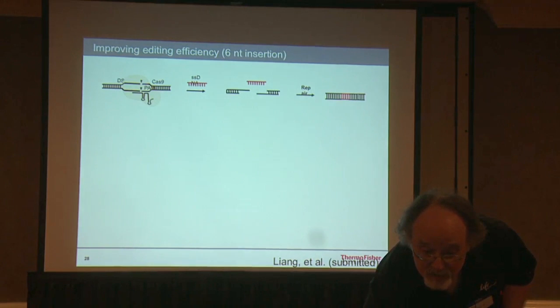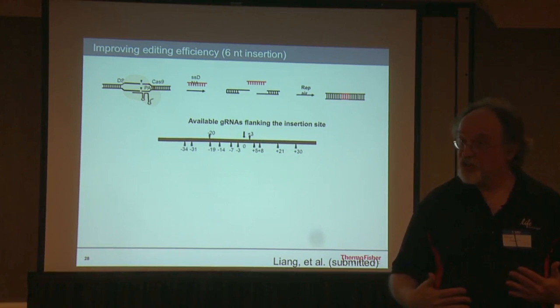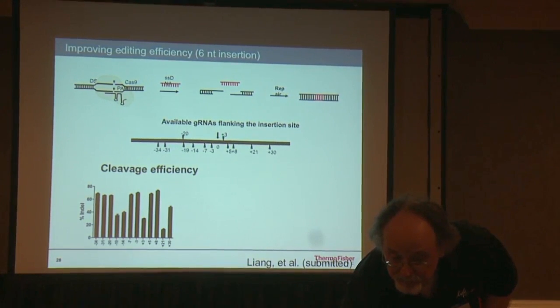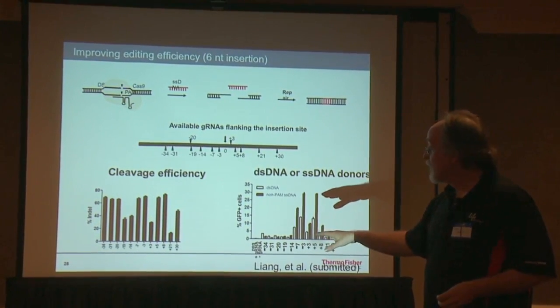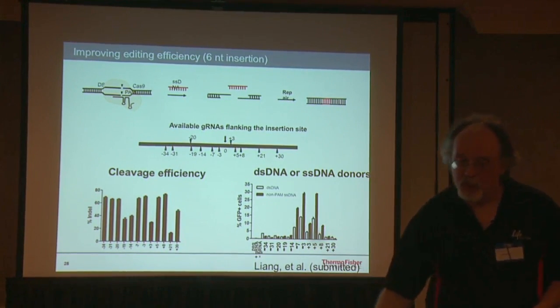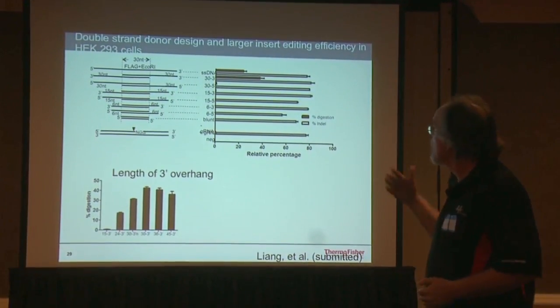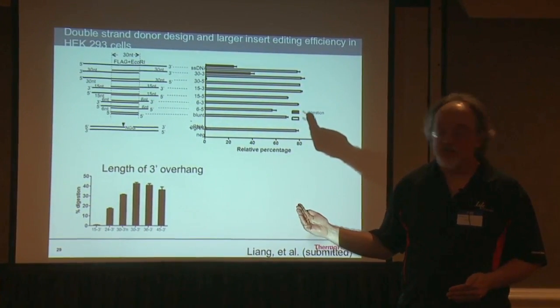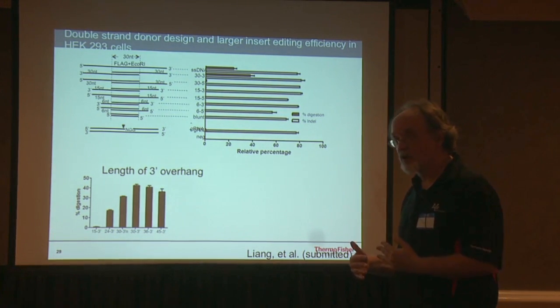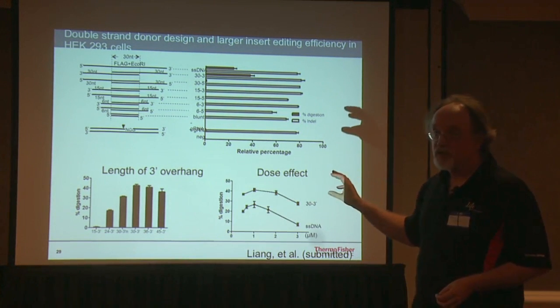And what's that going to ultimately involve? It's going to involve understanding the model of how insertions should take place once you do a cleavage with a Cas9 or a TALEN. It's going to involve looking at the best places to introduce a donor and the best donor designs to use. And it's going to result in models for how you do this design, which will then be built into our software and into our validated reagent sets so that you can do these kinds of experiments in the most efficient way possible.